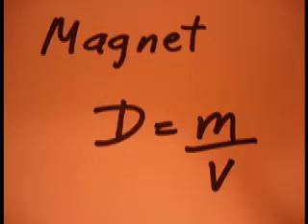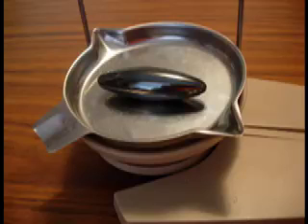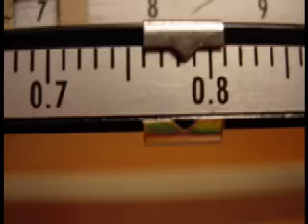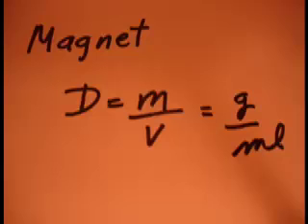Here's a small magnet. We put the magnet on the scale and then make sure that the scale zeroes in. The balance is balanced when it reaches 47.783. We'll call the mass in grams 47.783. We have the grams. Now we need to find the volume.